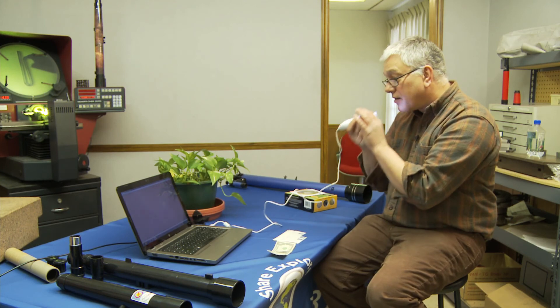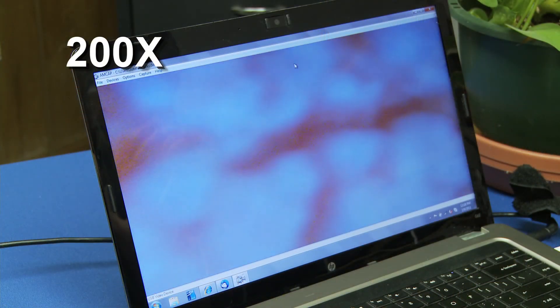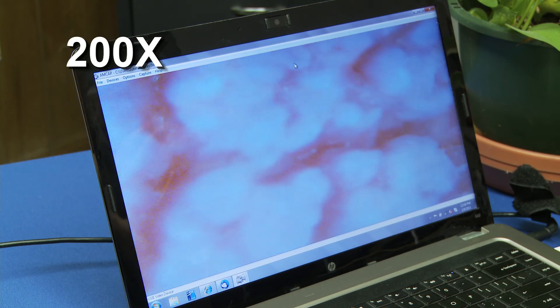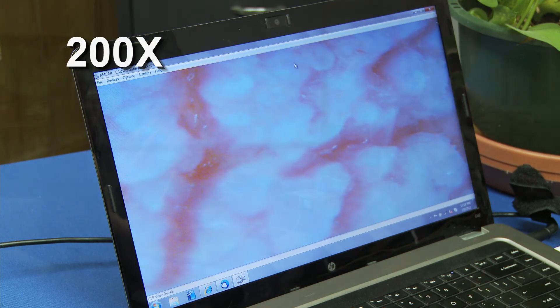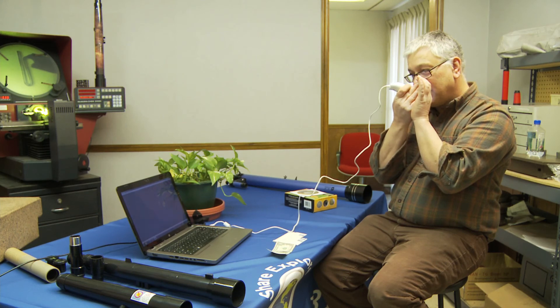I can go back to my tongue if I can see it. And you can really see detail.